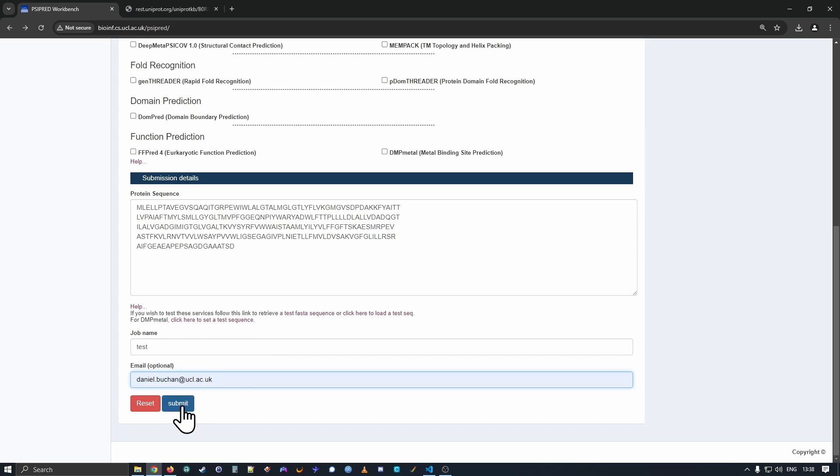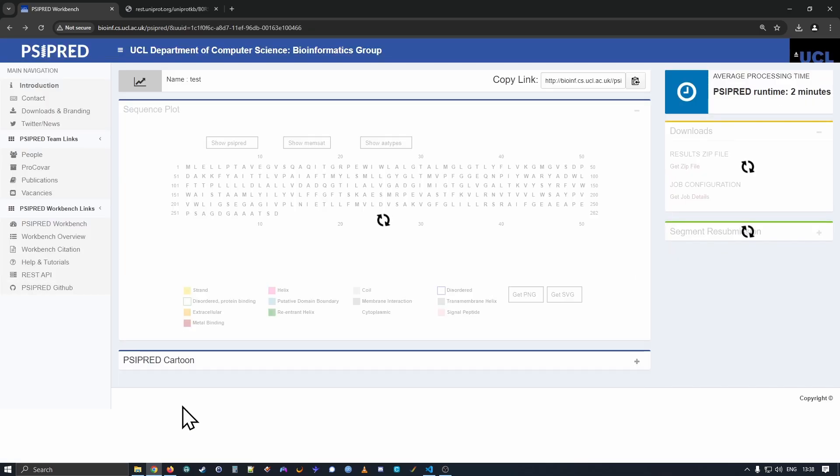So having filled in the form, we can press the submit button. So I'm pressing the submit button, we get the initial results page. And so the results page shows you that things are processing.